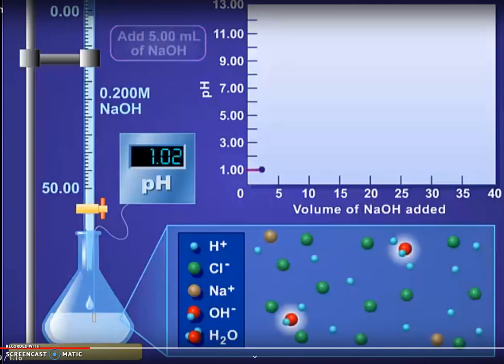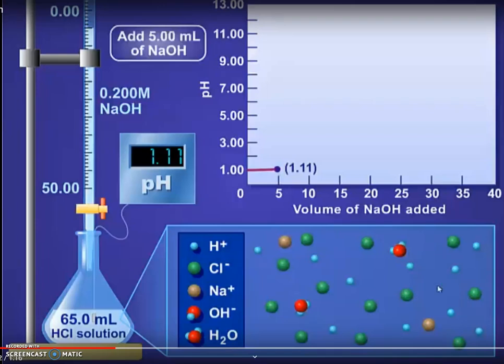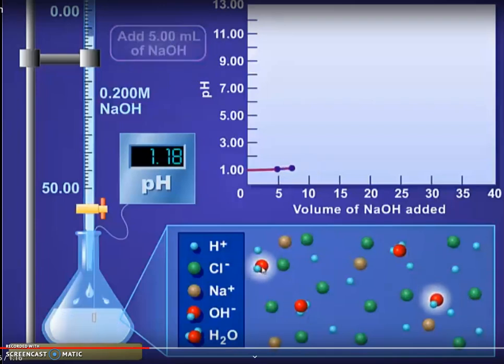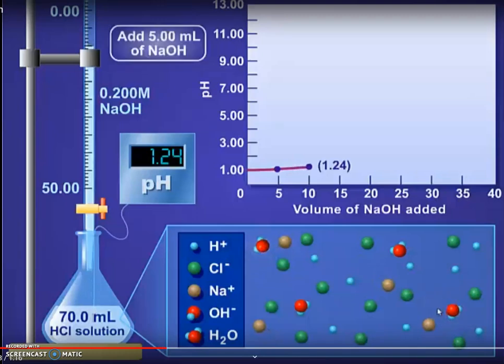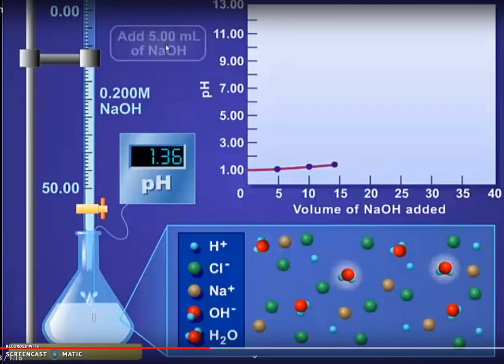As it's added, the pH starts to increase. This is because some of the acid has been used up. This trend continues. The pH starts to increase slightly again. Ten mL have been added, it's now pH 1.24. And at 15 mL here, we can see it's 1.40.